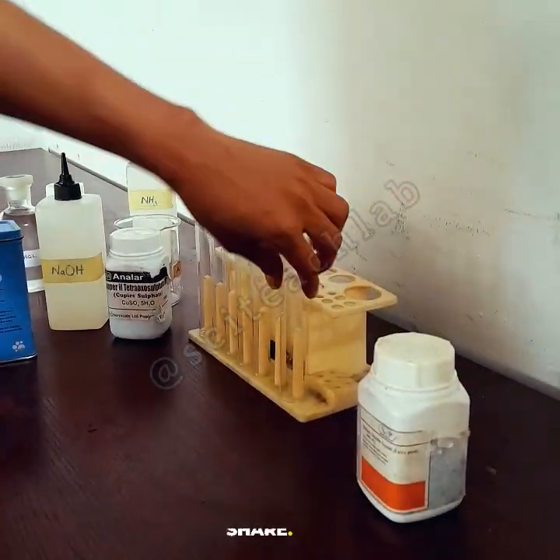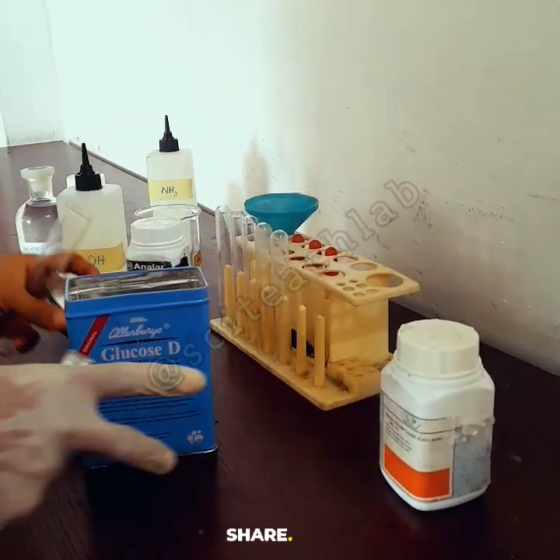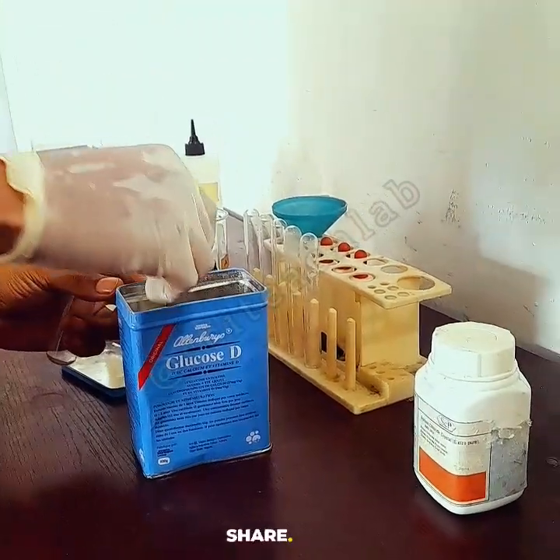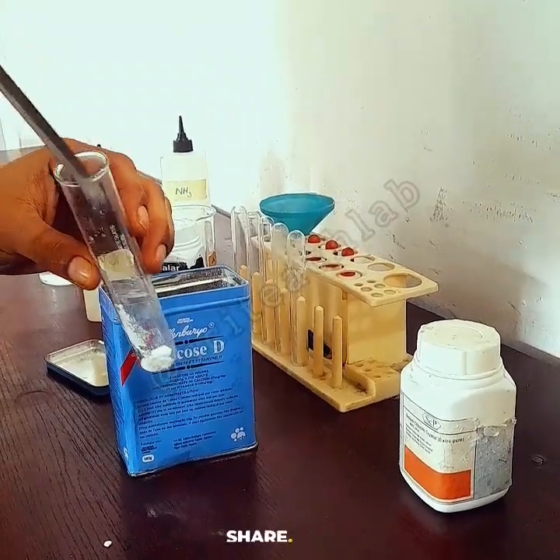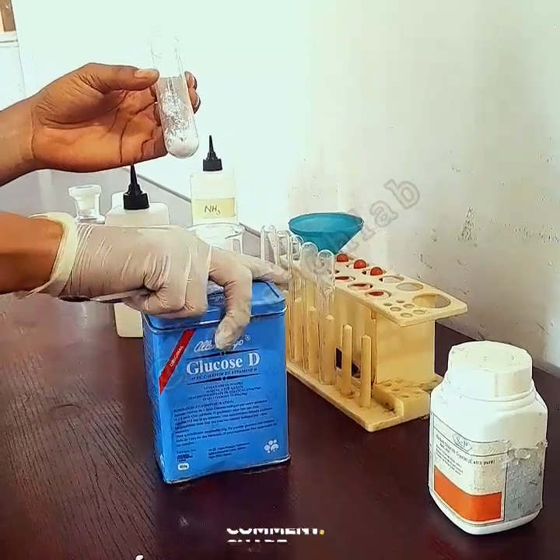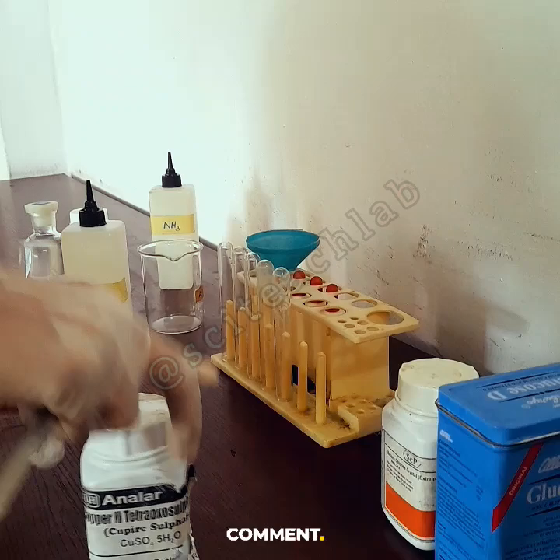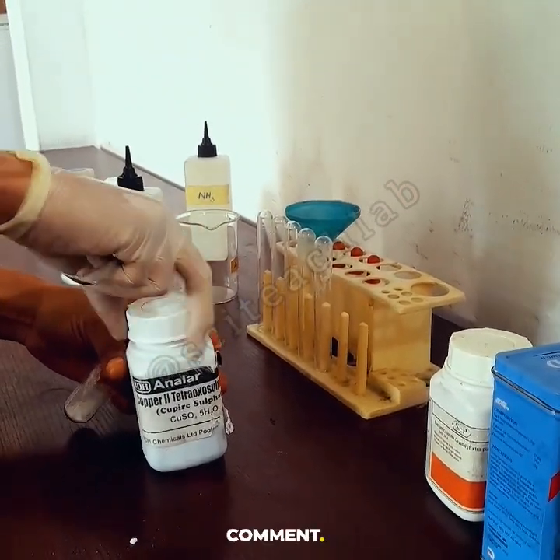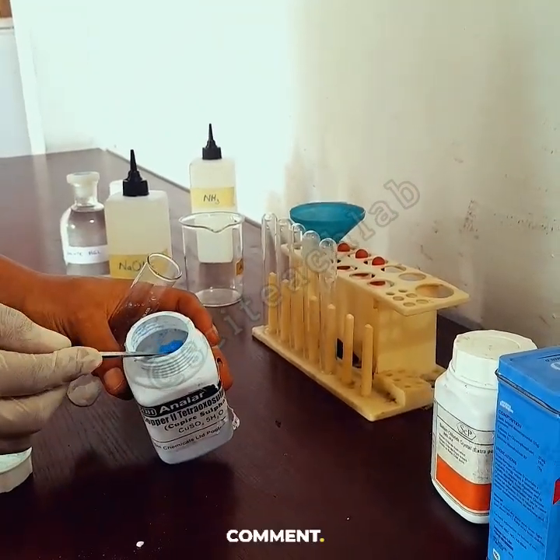So we have to start by mixing up the two substances. Here's my glucose. I'm going to put a little amount of glucose into a test tube. Since the analysis is a mixture of glucose and copper sulfate, we add glucose and copper sulfate to form the mixture of salts. We're going to mix that and call that C.